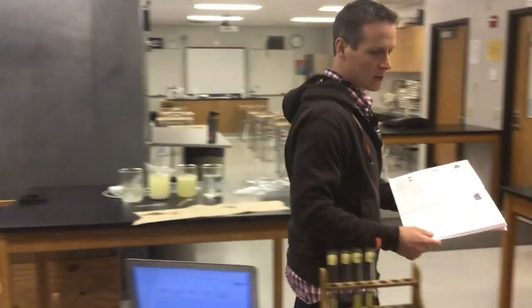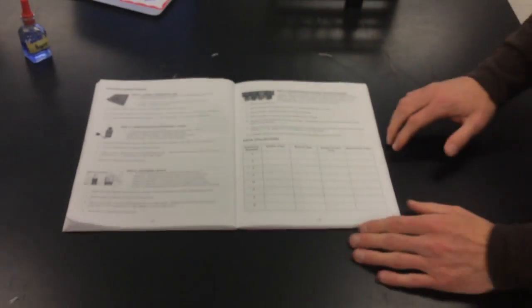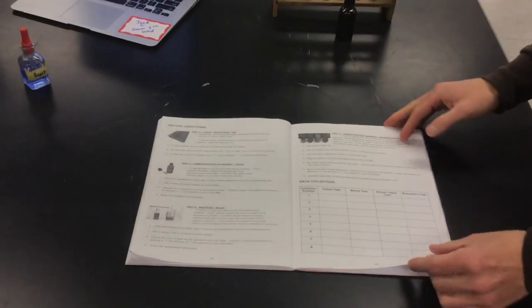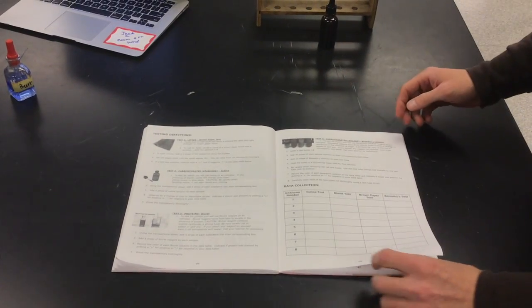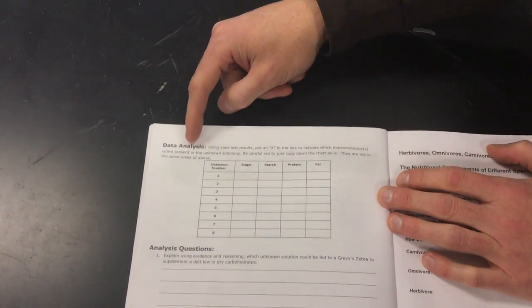And I'll come around here. Mr. Kedzie will kind of zoom in on this. So you have your data recorded here. So you've seen that already. So which unknowns have which macromolecules? We're going to go over here to this page. And we'll notice there's a question on data analysis.